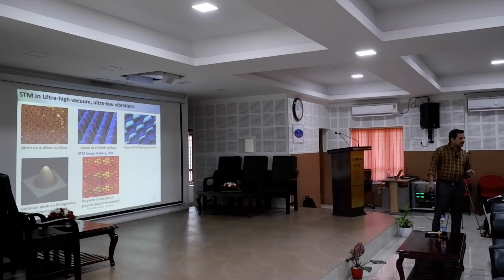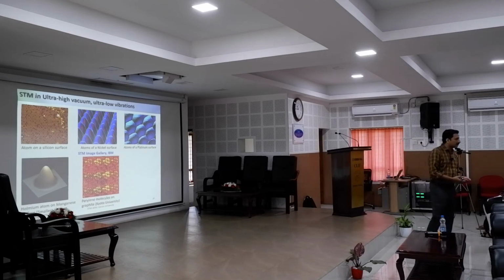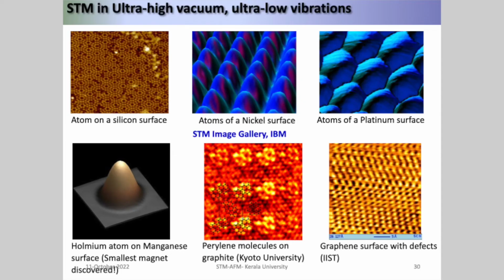The important thing about STM is that, as I told you before, you have to know what we are looking at. If it is a molecule, suppose it's benzene or pyridine or whatever it is, you have to know how it looks before you look at it. Because what you are expecting, if it is benzene, is hexagonal, doesn't mean that you are going to see hexagonal atoms. What you are going to measure in a molecule is the total molecular orbital there. I will show you some examples. You see, these hexagons drawn here are drawn by hand or by software. The actual molecules look like this.